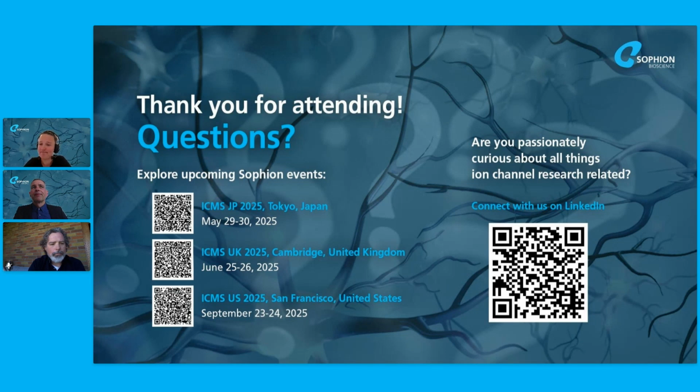That is a good question. I think I would have to look closer into the data to explain that. We do see a small offset in the activation curve at the very low voltages, with the disease cell line opening a bit earlier than the wild type, and we have had some speculation that could affect this, but otherwise I think this is something I would have to come back to when I had a closer look at the data.